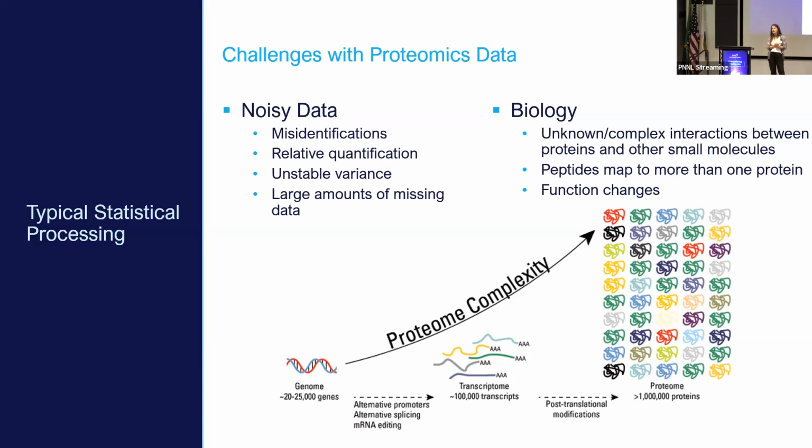But we have an R package that is available on GitHub that's tied to PMART-R that basically wraps up a number of the different batch effect correction methods available in the literature that we were able to incorporate into this R package, so that you can just insert that batch effect correction step into your overall workflow without having to reformat your data to get it to the right form.